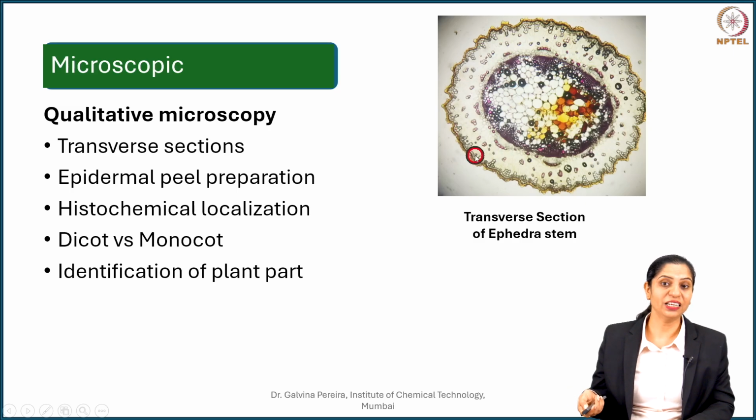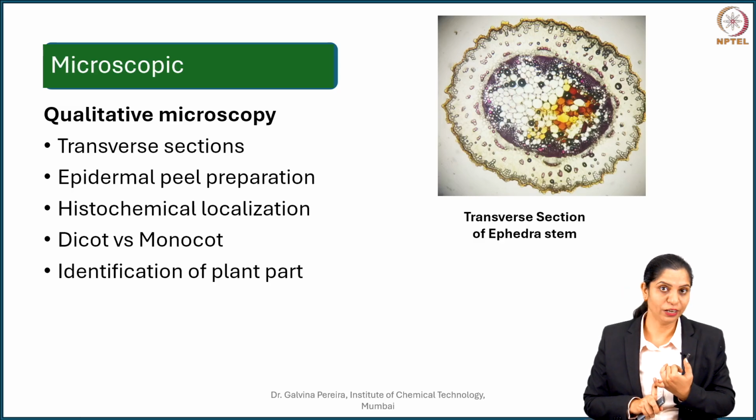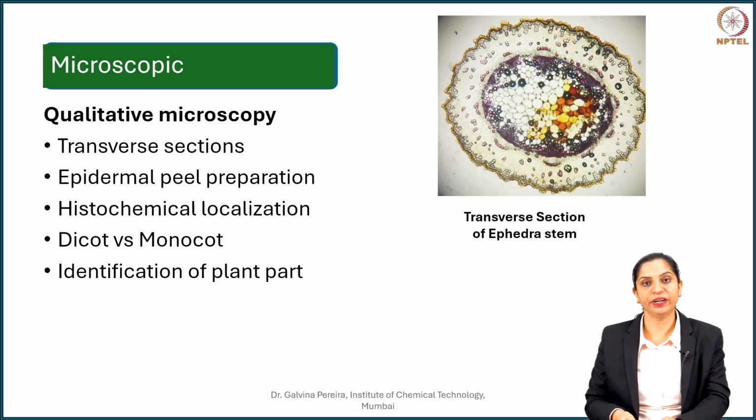This is definitely a xerophytic plant because, deep down, it shows what are called sunken stomata. Now epidermal peel will also give you some idea. When you peel the epidermis of a drug, it has numerous structures like your stomata, the shape of epidermal cells, and the arrangement of trichomes, glandular and covering trichomes, all seen in your epidermal peel.